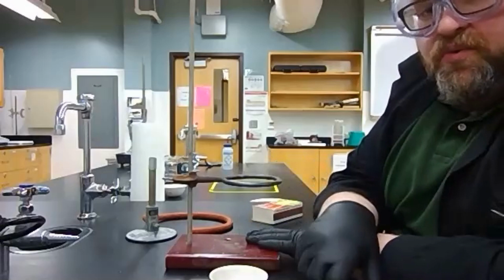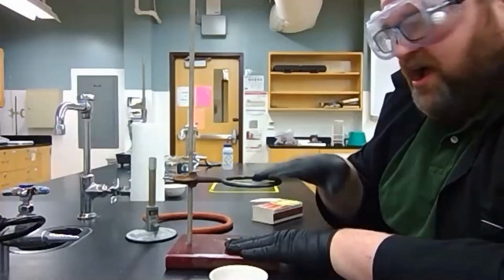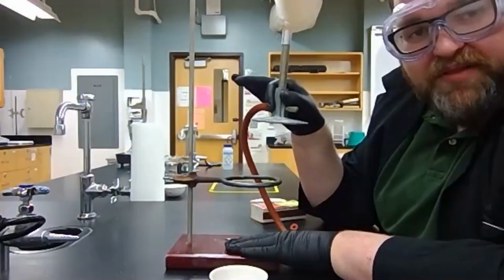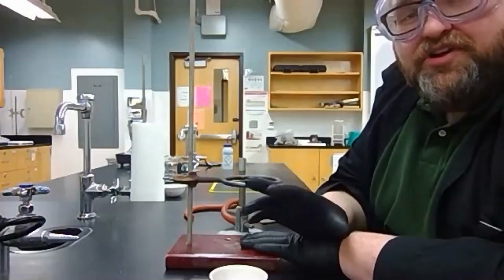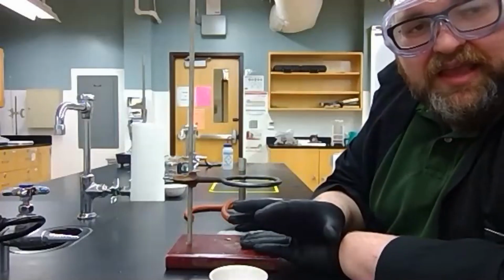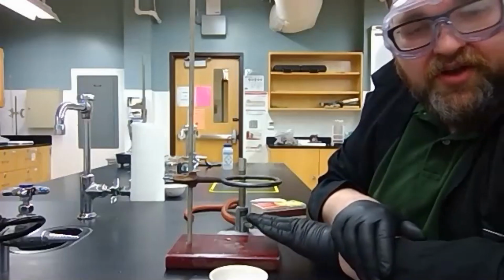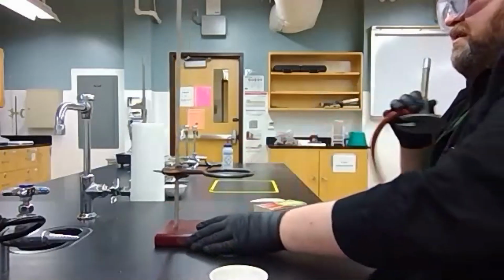So for this setup, we're going to need a clay triangle, a ring stand with an iron ring, a Bunsen burner, your evaporating dish with your sample, and you're going to need a set of crucible tongs at the end as well as a wire gauze to cool this on. So first thing we're going to do is we need to set up our Bunsen burner.